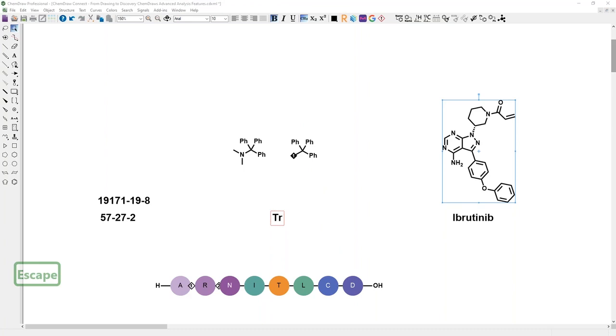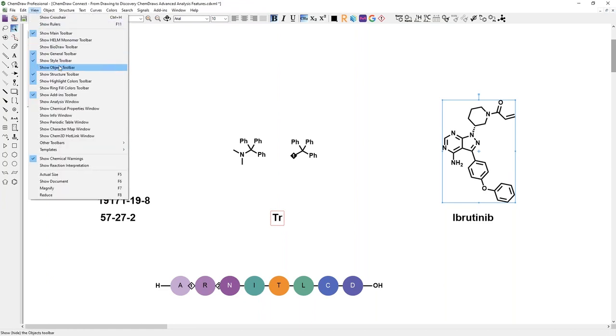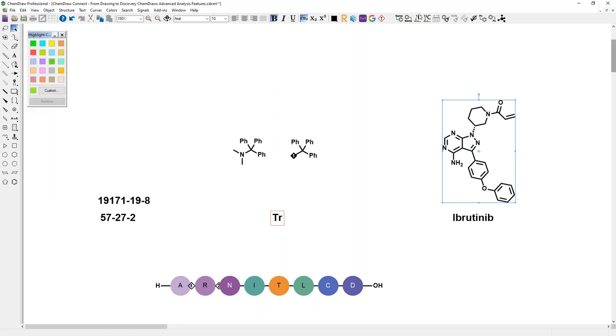to it. There's another question: where again to find the NMR function, in which toolbar is this? So that is part of the structure toolbar. Once you've activated it, this is the one I have over here. You will see there the proton and carbon NMR prediction buttons.